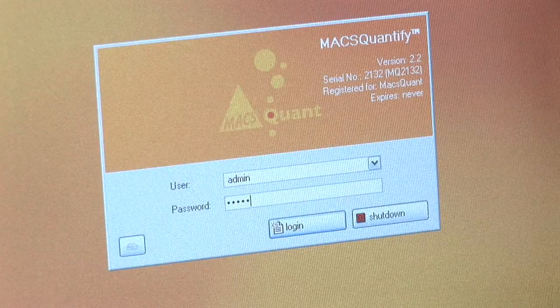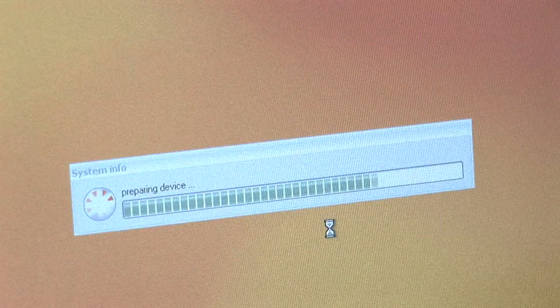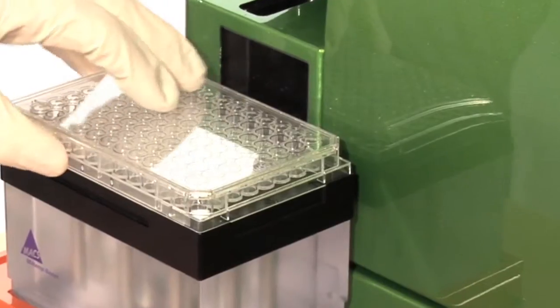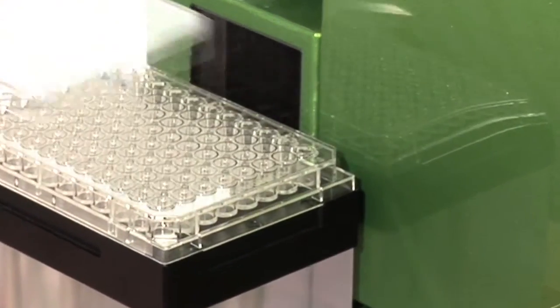Let me show you how. First, log into custom mode. Place the 96-well sample plate with preloaded samples onto the MaxChill 96 rack.